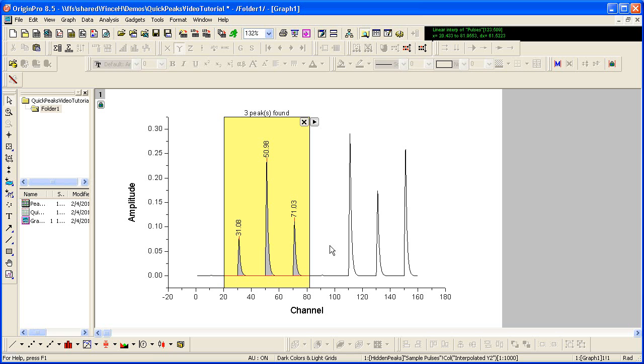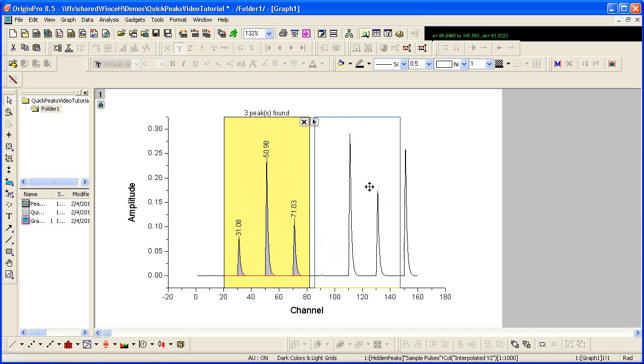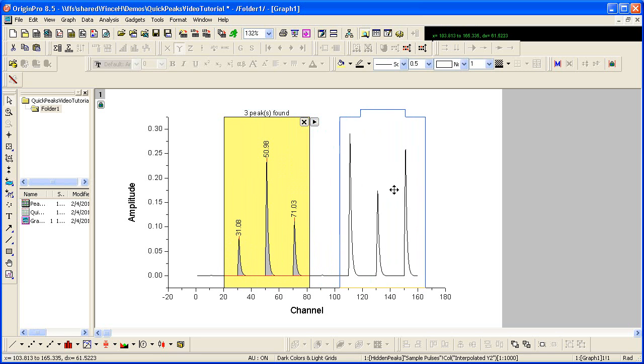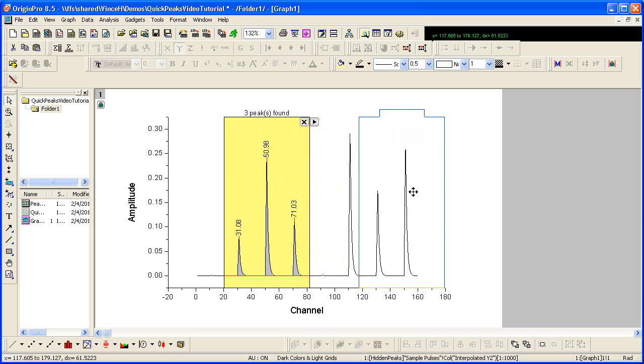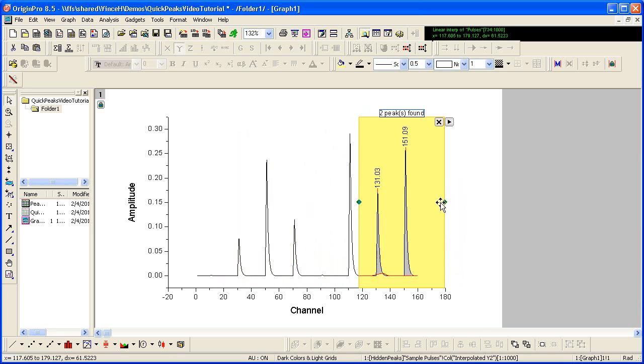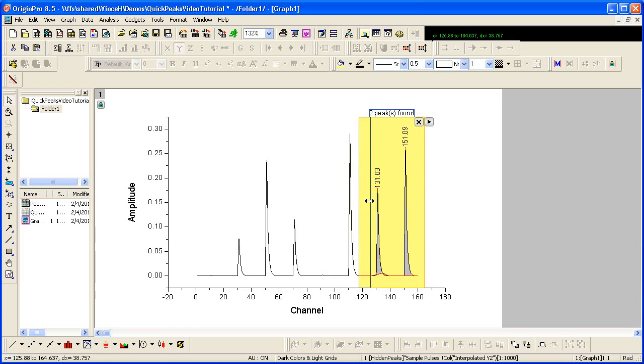You can move this region of interest by clicking and dragging with the mouse. And you can also resize the region of interest by clicking on the object handles.